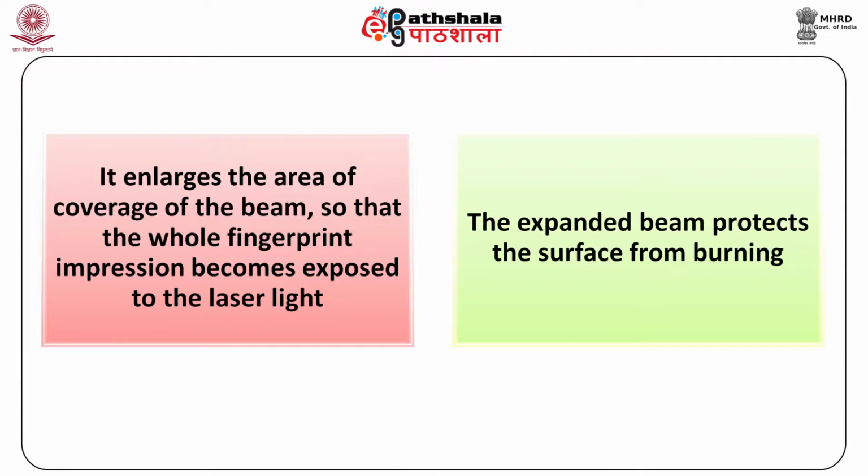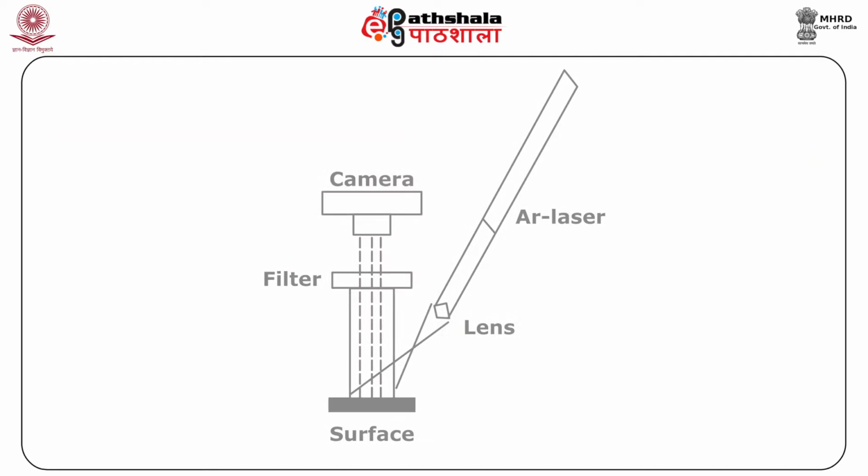This serves two purposes. Firstly, it enlarges the area of coverage of the beam so that the whole fingerprint impression becomes exposed to the laser light. Secondly, the expanded beam protects the surface from burning. The imprint is observed through a safety filter. Such filters absorb the short wavelength components and transmit the longer ones, thus protecting the observer's eye.